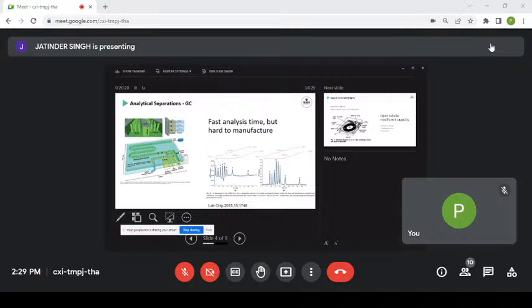The reason that it's a couple of meters long is that they want a lot of surface area to allow the analyte to bind and be released, or be absorbed and come back, pretty much like the analytes do in liquid chromatography. The idea of chromatography is the analytes get stuck onto the stationary phase and then released into the mobile phase again. The more affinity they have for the stationary phase, the longer they're stuck on the wall, and therefore the more their retention and the longer it takes for them to be detected.